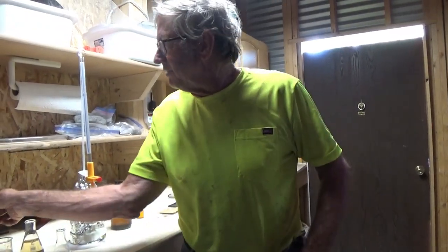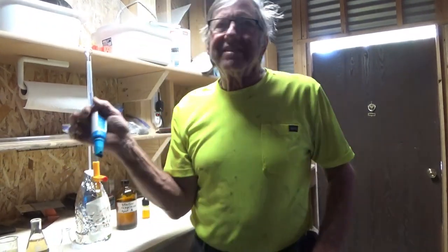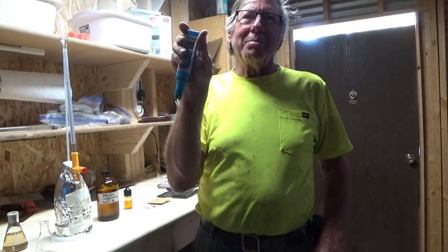We're here in our little field expedient lab where we're doing our leaching experiments. And the leaching solution that we use to dissolve the gold, there's three major things you need to keep track of. Number one is something called the pH. That's the alkalinity or the acidity of the solution. We need to keep the pH around a 10 to a 10.5. This is easily accomplished with something called a pH meter. It simply measures the pH.